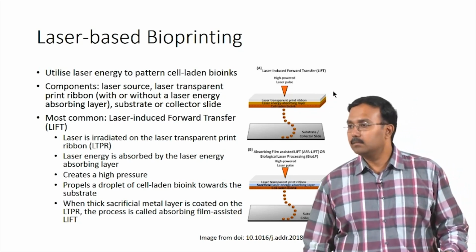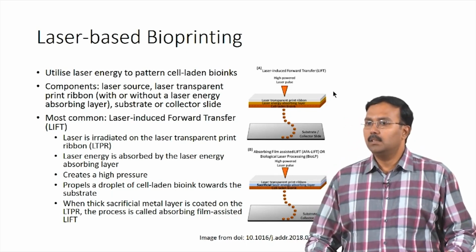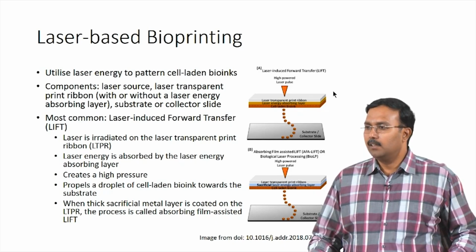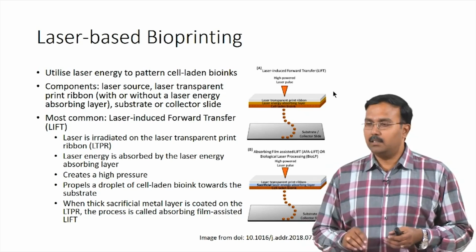So, sir, the droplet, that means the ink is in a semi-solid state? Is that what you are saying? Like a highly viscous fluid. It is a highly viscous fluid, which is loaded on the surface of this ribbon.